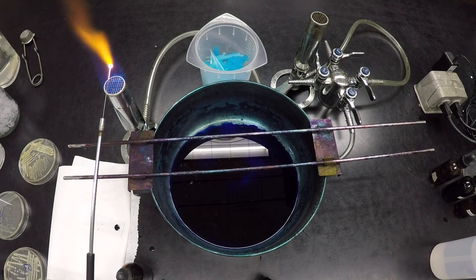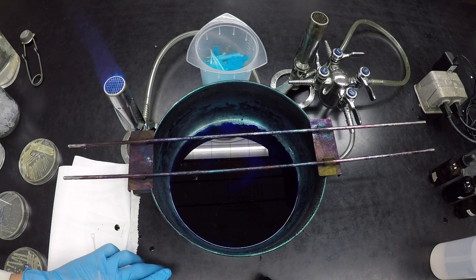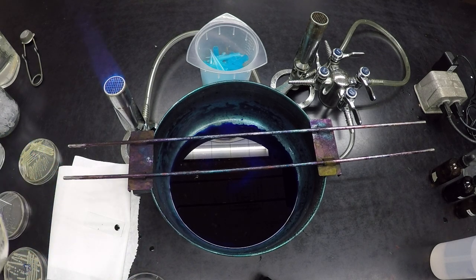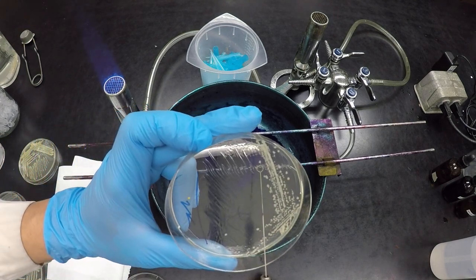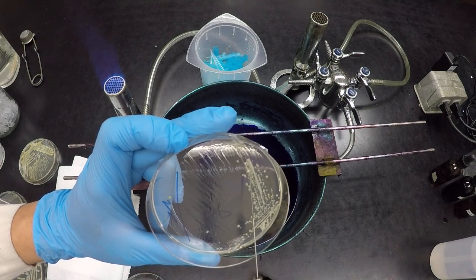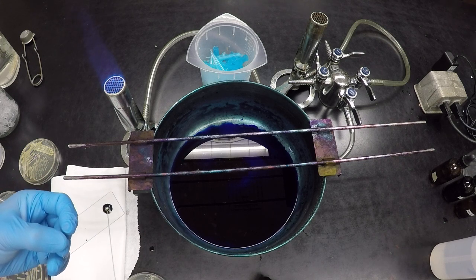And the bacterium that we're using here today is called Klebsiella pneumoniae. It's a nice endospore-forming bacteria. Sorry, did I say endospore? I'm all stuck in the wrong word. A nice capsule-forming bacterium. And then we're going to take our bacteria. Now, usually I always say take just a little bit. I find for things like the capsule stain, take a bunch, because you're going to spread this bacterium all over the whole slide, okay?